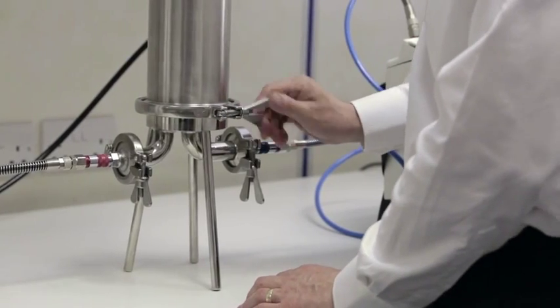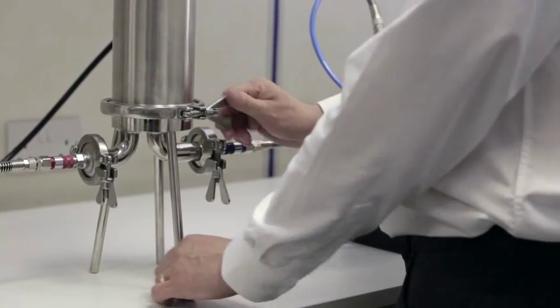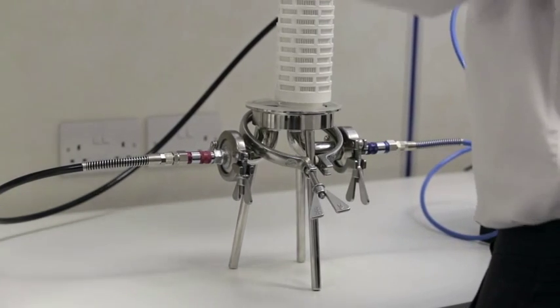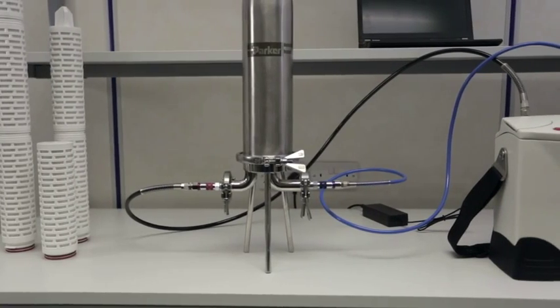A laser particle counter then detects any filter failures by screening the filtered gas for the presence of aerosol, which may have passed through a defect in the filter.